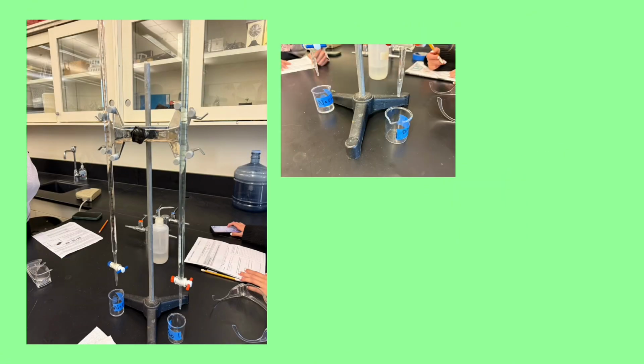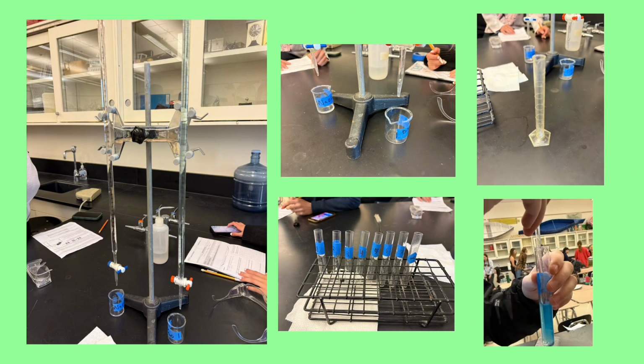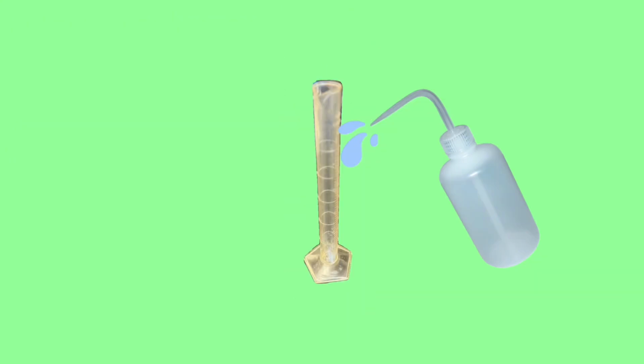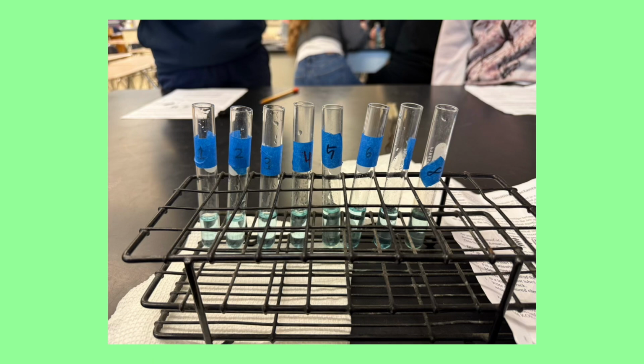Our lab group was provided with 2 burettes, 2 funnels, 2 beakers, 8 test tubes with a test tube rack, a graduated cylinder, and a stirring rod. Before conducting the experiment, it was very important for us to sanitize our equipment with distilled water to have an accurate outcome. To begin, we dispensed 5 milliliters of 0.1 molar CuSO4 in each test tube.